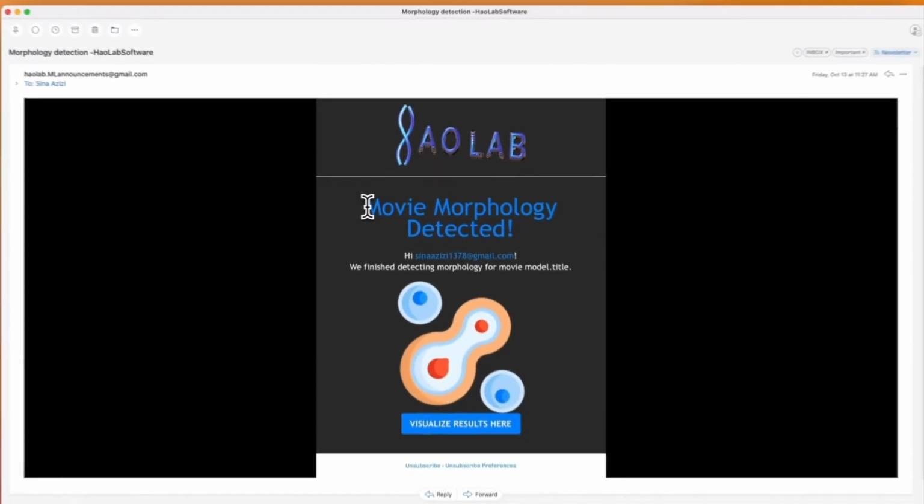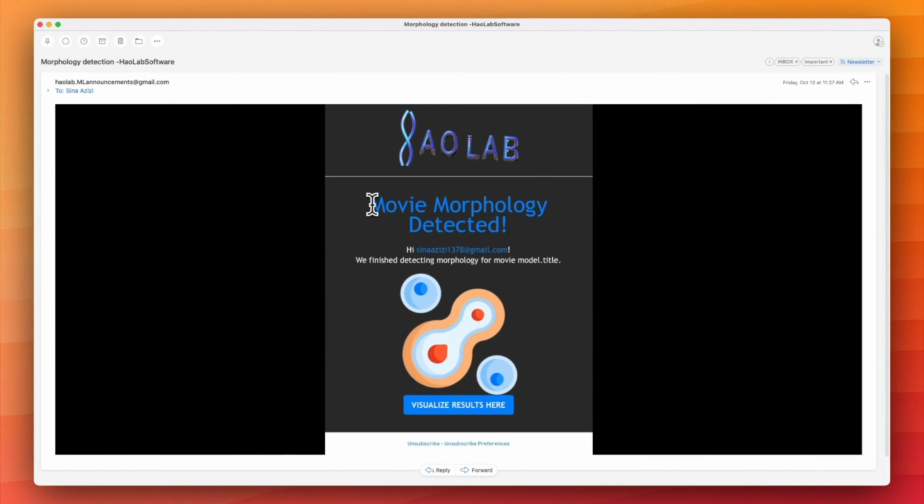Now, at this moment in time, you will receive this email, but we don't start processing until all the movies in the project have their tracking finalized. But in the future, we're going to probably do it on a movie by movie basis, so that once you finish one movie, you can see the results immediately afterwards. But right now, you just have to do all the movies all at the same time for one project. Until then, you can visualize all of the results at once.